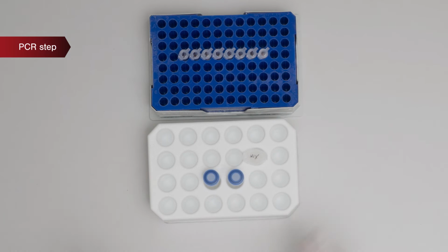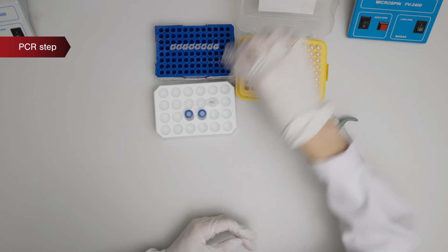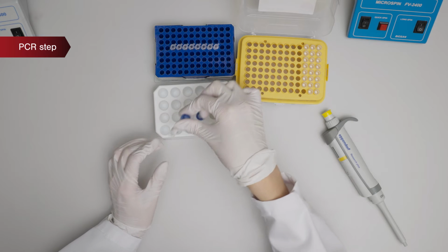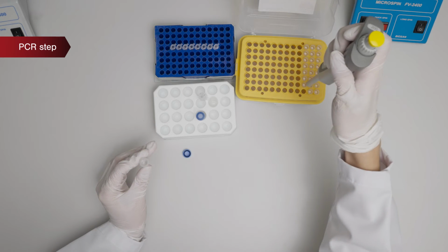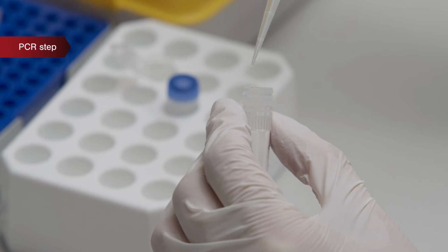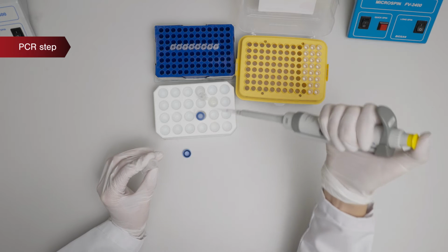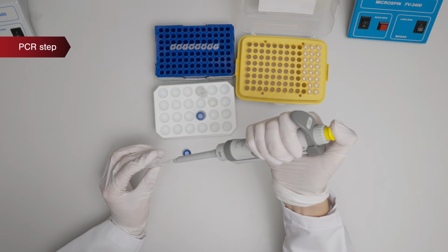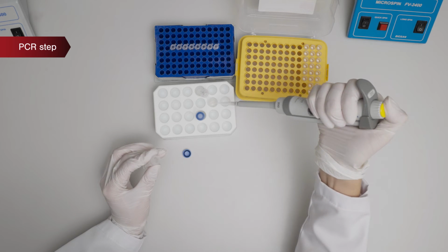For the PCR step, it is necessary to take 19 microliters of the sample from the previous step. The rest is saved as a backup if elution was done in 40 microliters of TE buffer. The PCR reaction mix is made from 25 microliters of PCR enzyme mix and 6 microliters of PCR primer mix for each sample, plus a reserve for pipetting errors.